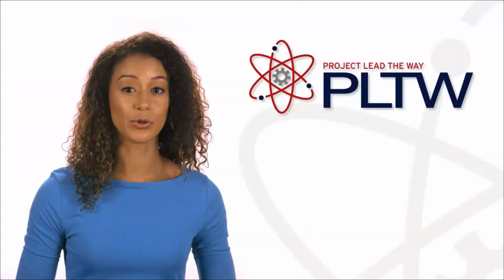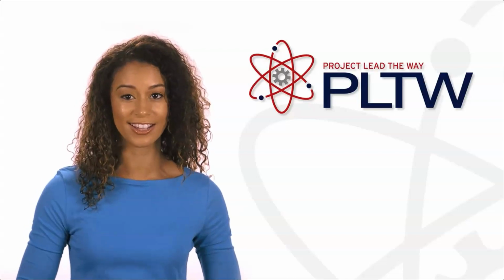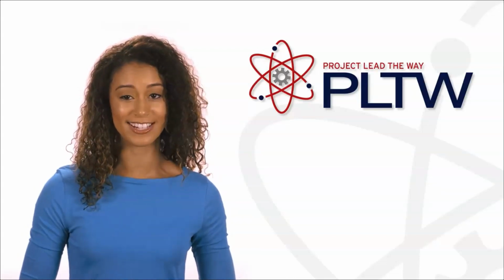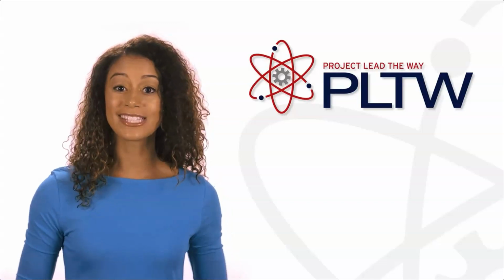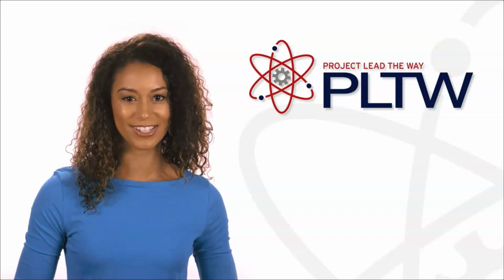A sample of Sue's lymph fluid was sent off to the lab in order to identify the pathogen that's making her sick. You'll need the sequence of the pathogen's DNA to determine its identity. You will help complete this analysis, but first, let's investigate how DNA sequencing works.